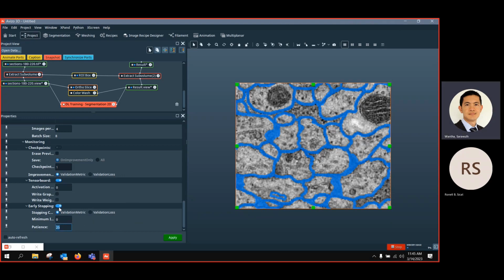So I just do it first and click apply. It's also important to have an internet connection because we need to connect to TensorBoard. So click apply. I'm going to run it quickly, and in a few moments TensorBoard should activate.